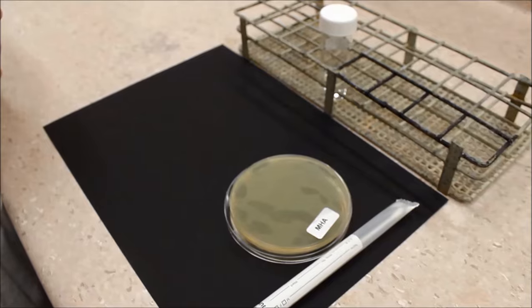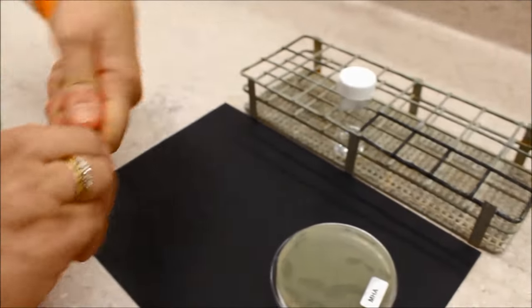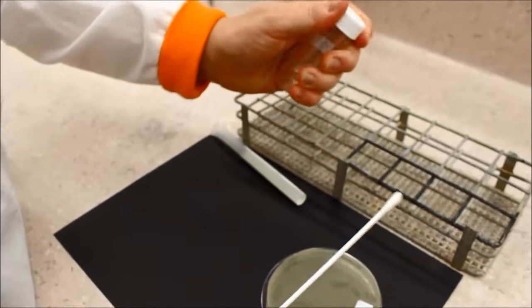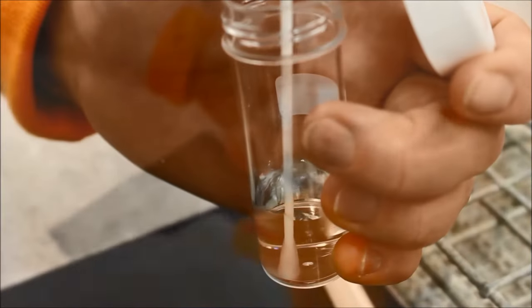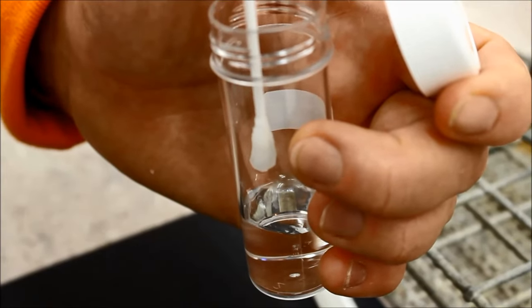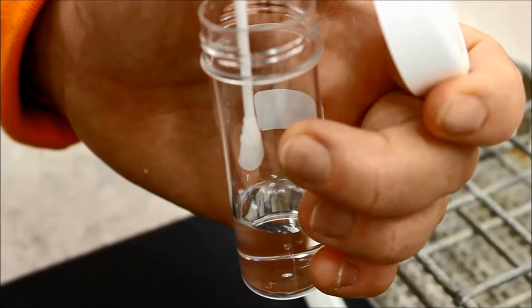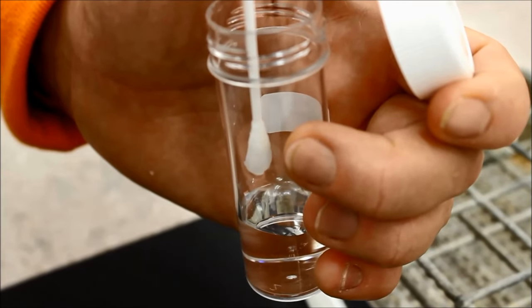Swabbing a plate and applying an e-test. Soak a sterile swab in a diluted bacterial culture and press against the inner wall of the tube to remove excess fluid.